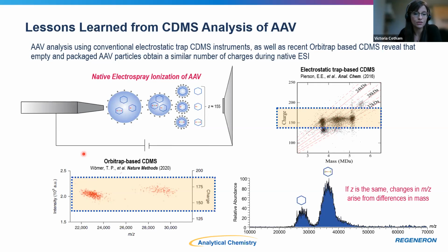purification ahead of time. So like the polishing step, that's technically in part a purification step. And we were able to look at our samples prior to the polishing step and get really good signal to noise. So I can't tell you from the very beginning of process development to these more later stages, but we have shown that, at later stages when we're fine tuning the process, we're able to easily look at these in-process samples without any issue using our desalting column on the front end.